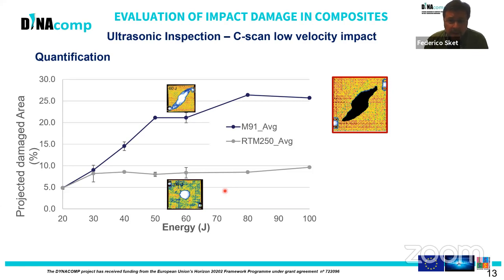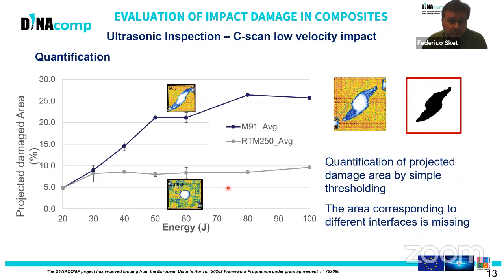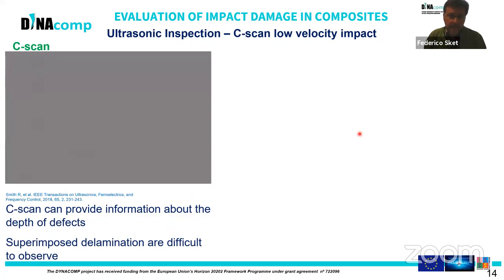Considering this, and taking into account that we have an A-scan in each point of the C-scan, we can obtain a sort of volume of the damage if we use a slightly different configuration of the C-scan parameters. This is what I wanted to show here. If this is performed, we have a third dimension corresponding with the depth of the composite panel. Let me see. I want to play this video.